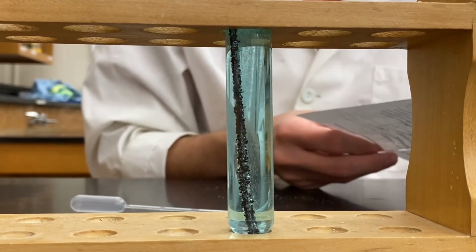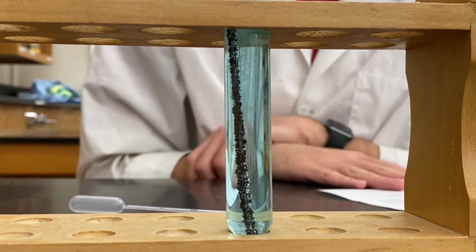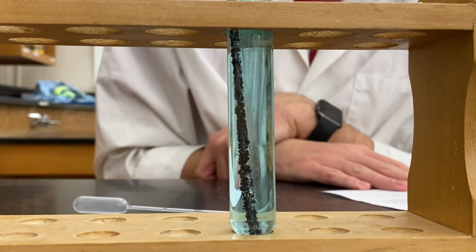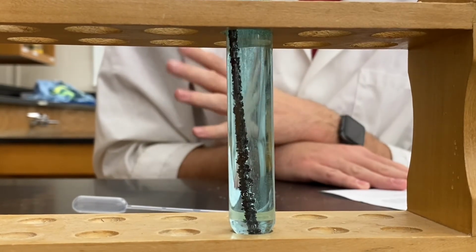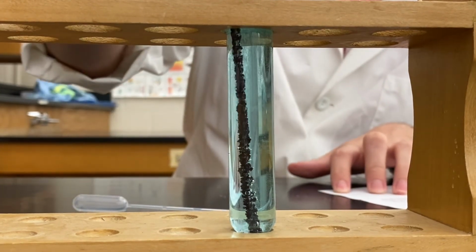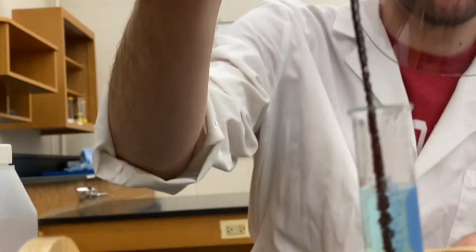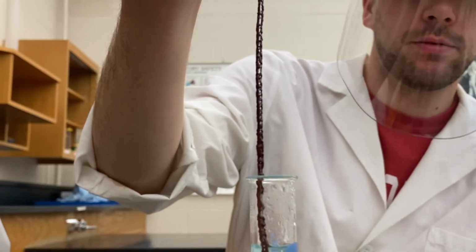In this reaction we started with the copper 2 chloride and the water in the solution, and then I added the aluminum wire, and the products here are copper and aluminum chloride. And so I'm going to pull the strip out just to show you the copper a little bit better. You can see the copper atoms forming on the wire.